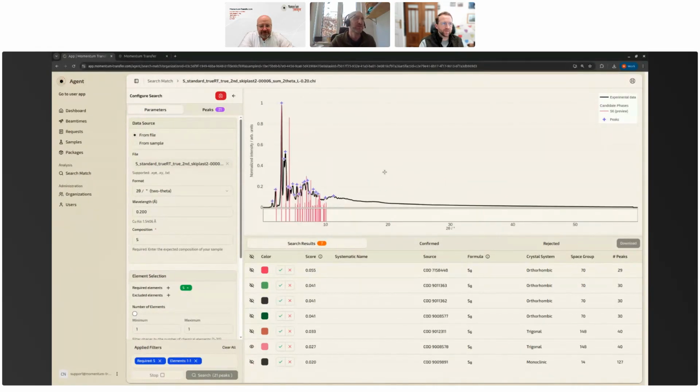But yeah, just from a general standpoint. Okay, so just to show that, and then I would jump into a slightly more complicated example, to show you a bit more of what you can do with this in a more complicated case. I don't know, Sebastian, if there's some other question we should answer in the meantime.